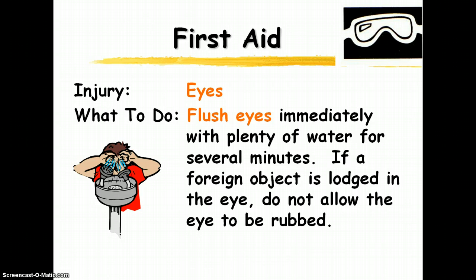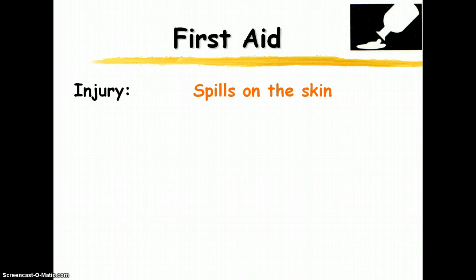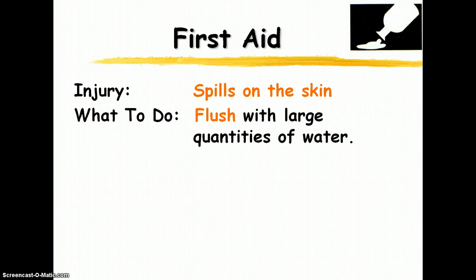For first aid: if you get a chemical in your eye, flush immediately — I will demonstrate this in class. If there's a foreign object lodged in your eye, do not rub it no matter how much you want to; wait to have it properly removed so you don't cause more damage. Any chemical spills on your skin should be flushed with large quantities of water immediately — don't wait. And that's the end of lab safety. Have a marvelous day.